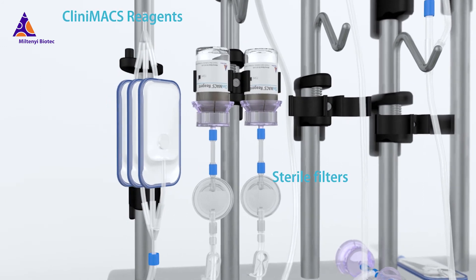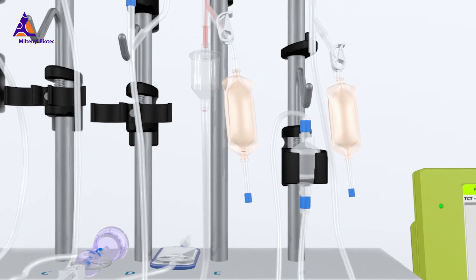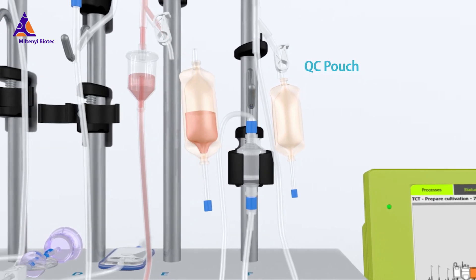The built-in sterile filters keep your cells safe. Integrated sample pouches simplify sampling for in-process and final quality control of the cell material throughout the manufacturing run.